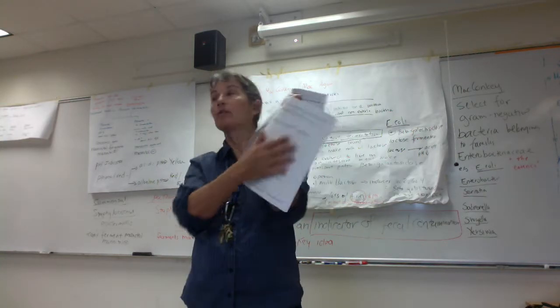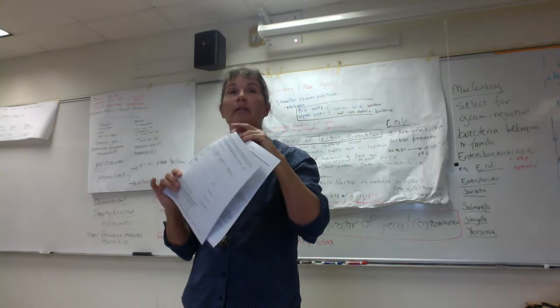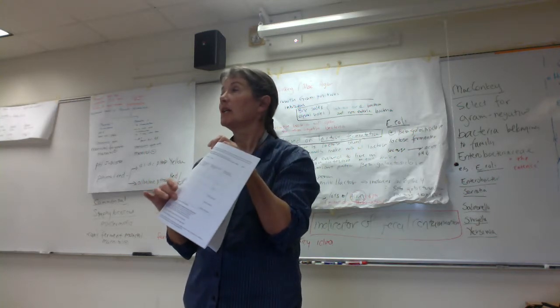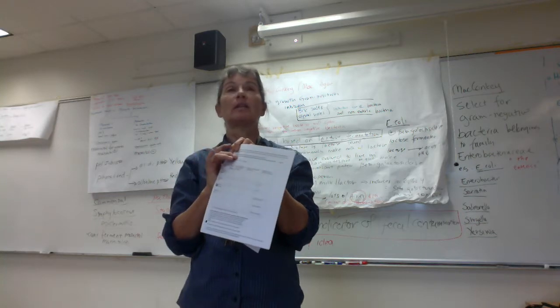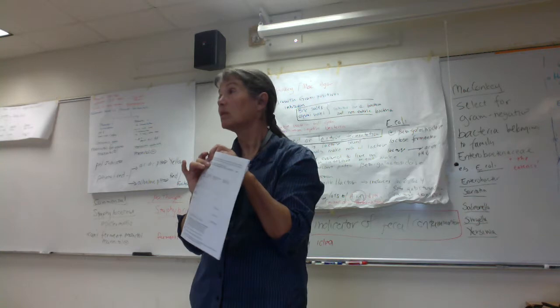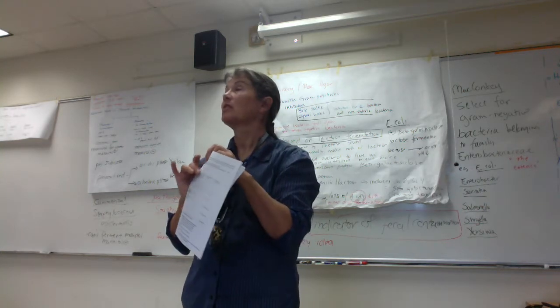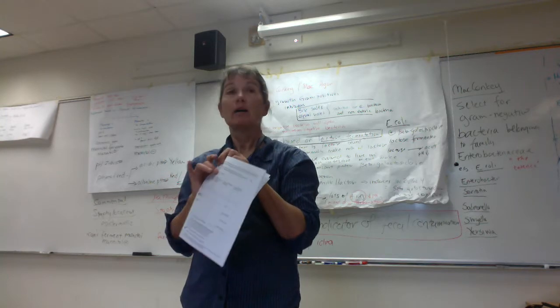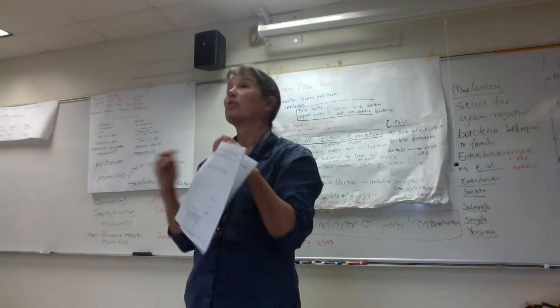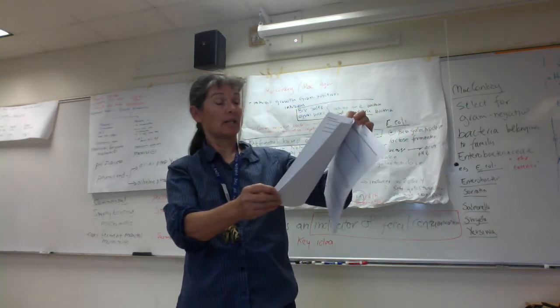And then, folks, on page 5, there's a table here to help you get ready for the lab exam 2. So you're identifying the functional type of the media. If it's selective media, you're identifying the inhibitors. You need to know what's inhibited, what will grow, what you select for. And if the medium is differential, understanding how the medium is differential, how would different microbes appear, what are the differential ingredients. So it's just a table to help organize your thoughts.